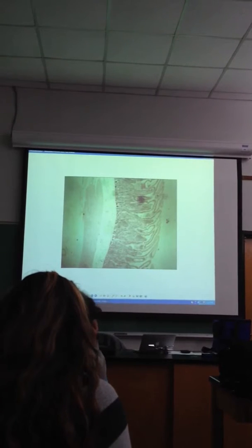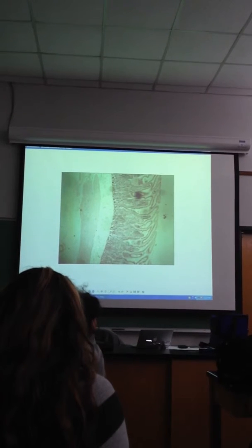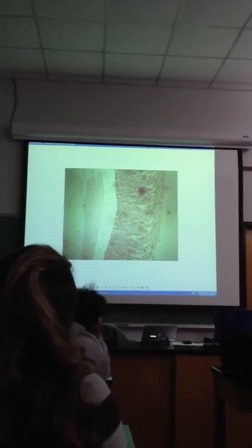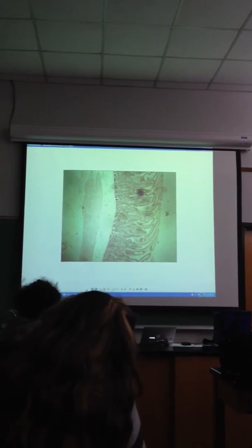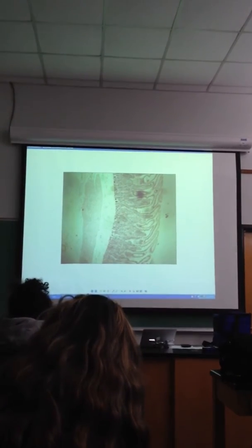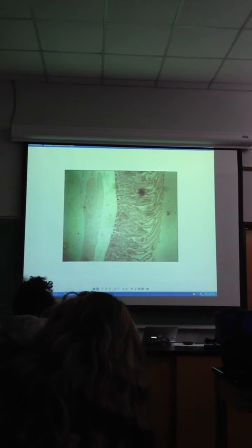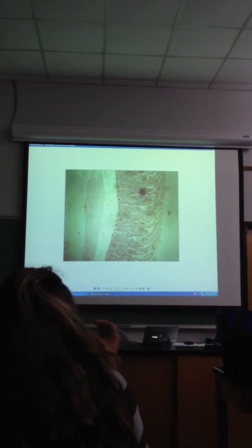In the duodenum, the way that we tell the difference is that the villi look different. In the duodenum, the villi are usually shorter. They're a little bit wider at the base. If we went back and compared, which I'm probably not going to do, the base of the villus is here. You see it come up like that and then come back. But this is wider than what you saw in the previous slide. It's also, if you stretch them out, these are kind of bent up, but they would be shorter than what were in the previous slide as well. The reason is because there's not a lot of absorption going on in the duodenum. There's mainly digestion. So you get longer villi where the most absorption occurs, which is actually through that second section, the jejunum.